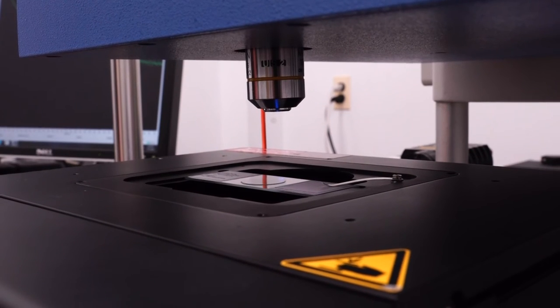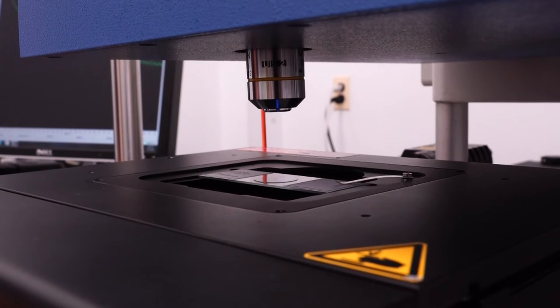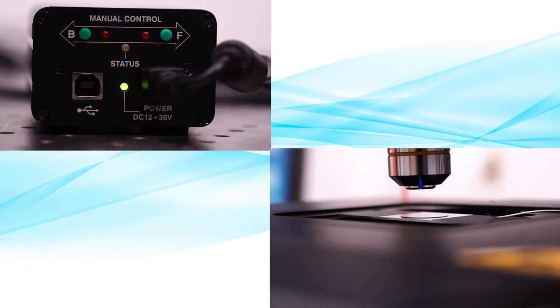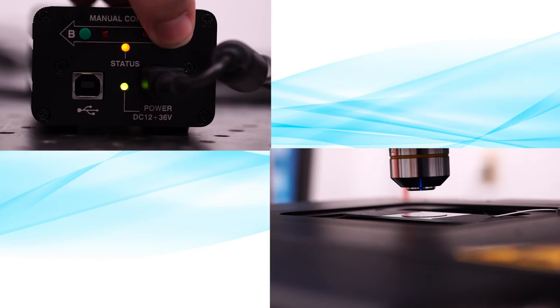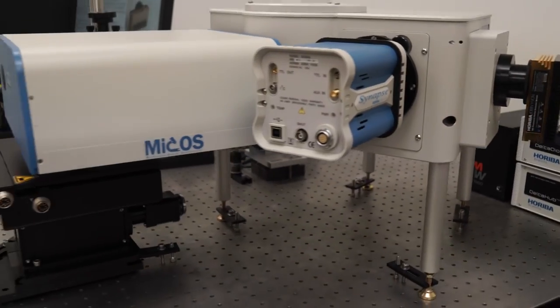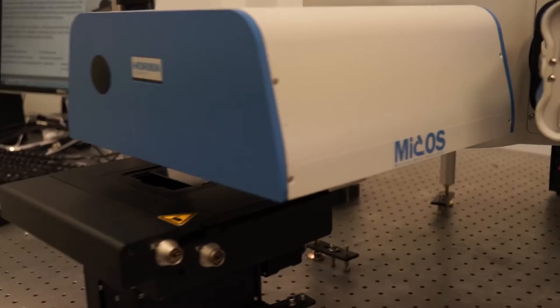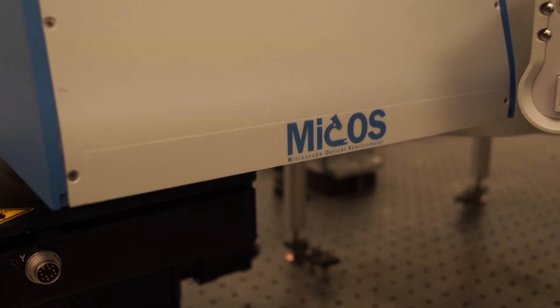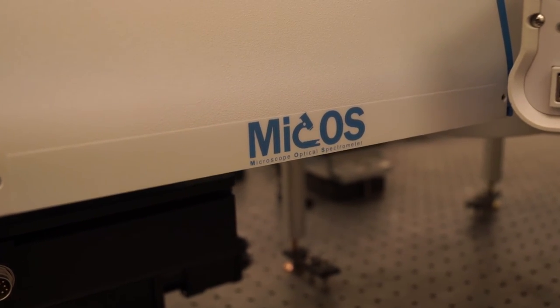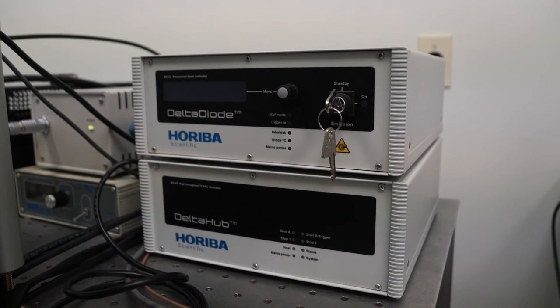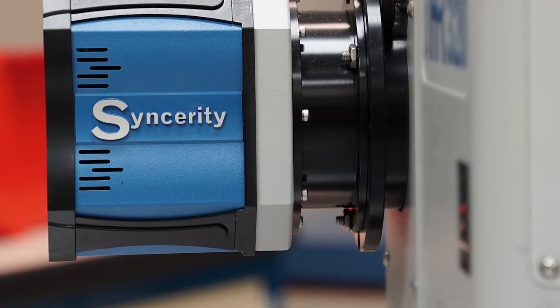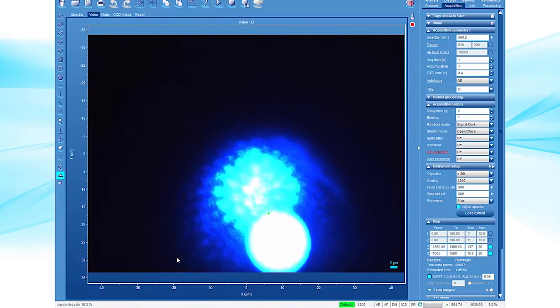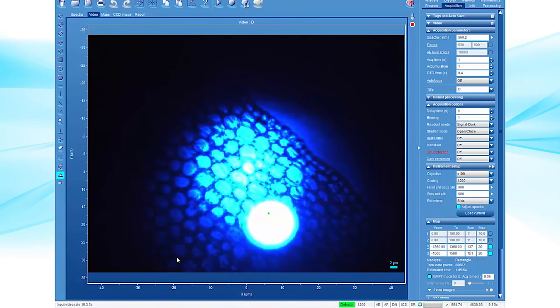The MICOS microscope optical spectrometer combines both steady-state and time-resolved photoluminescence measurements on a single, compact instrument. The ability to accommodate multiple laser sources and detectors provides unprecedented flexibility with spectral coverage from the UV to near IR.